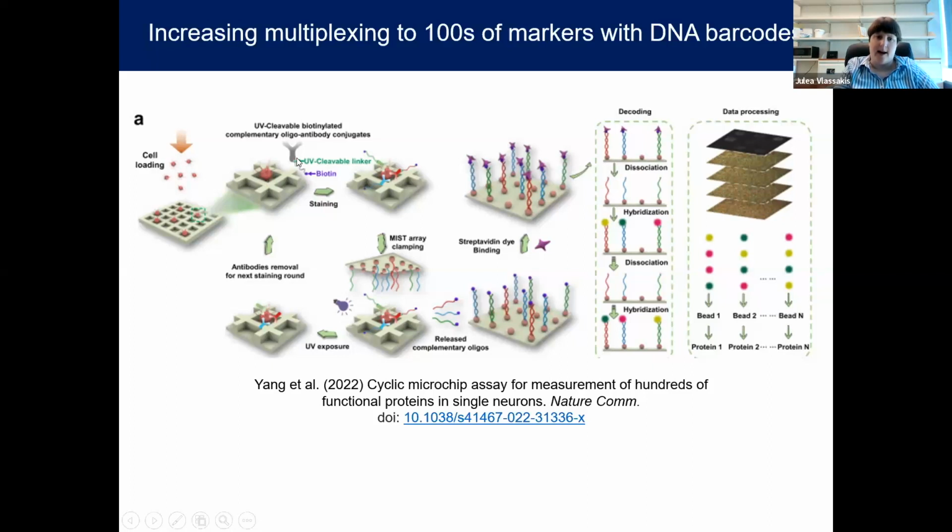So after allowing the antibodies to bind to either the surface or intracellular targets, the microarray with the cells is interfaced with an array with millions of microbeads.